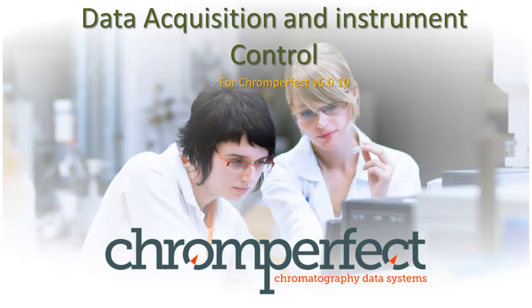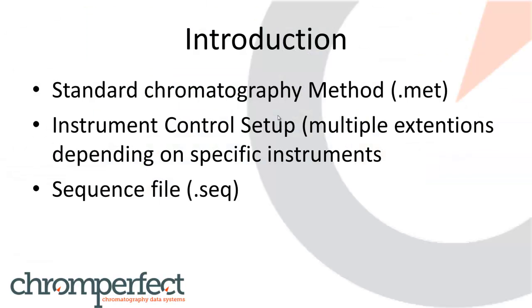Today, we're going to look at how Chromperfect can control many modern instruments. We will look at a standard chromatography method, an instrument control setpoint file. We will also look at the Chromperfect sequence editor, using an instrument autosampler, or a series of manual injections. Using a sequence allows multiple analyses to be run automatically, with different method and setpoint files. This process allows you to fully automate data acquisition without human intervention.